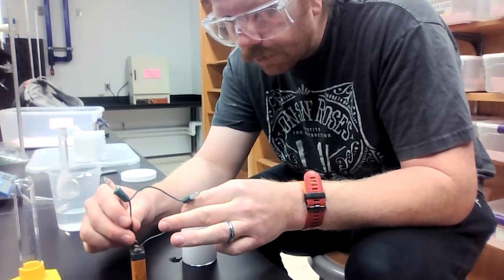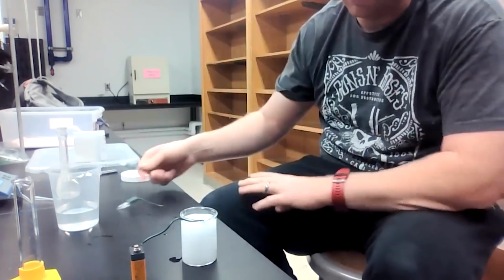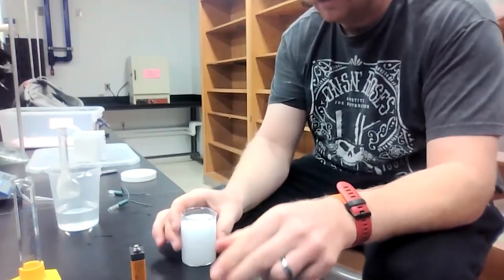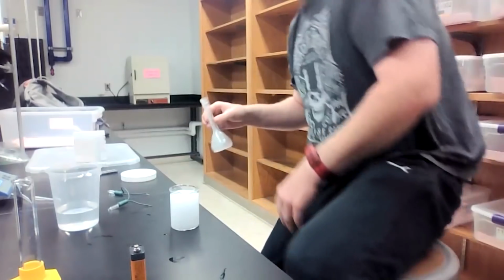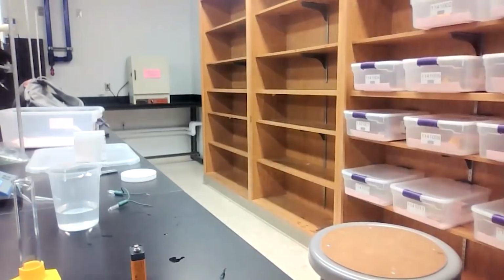So no matter how much, or this is all of that calcium carbonate, this is arguably insoluble. And look at this volumetric flask, super cloudy on the interior. I need to dispose of this in my waste container.